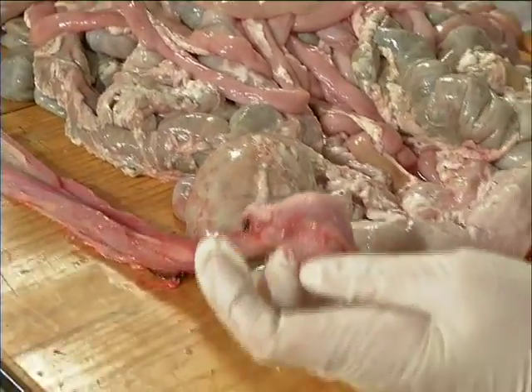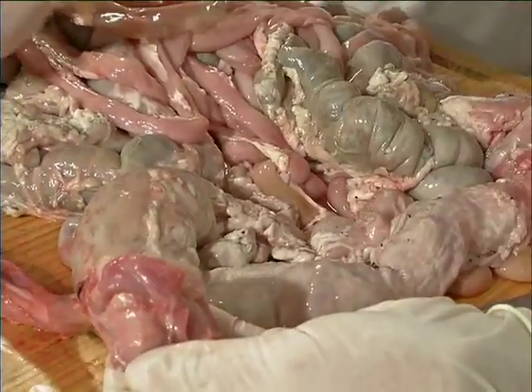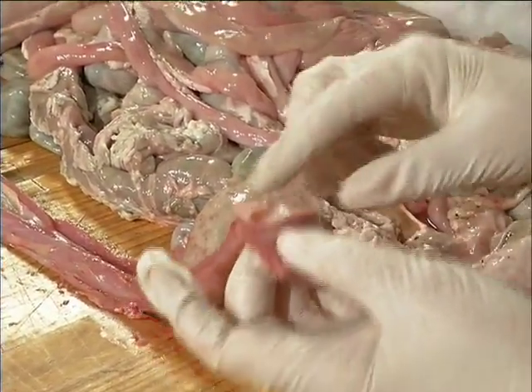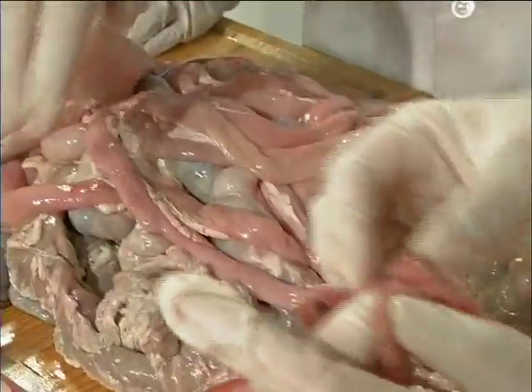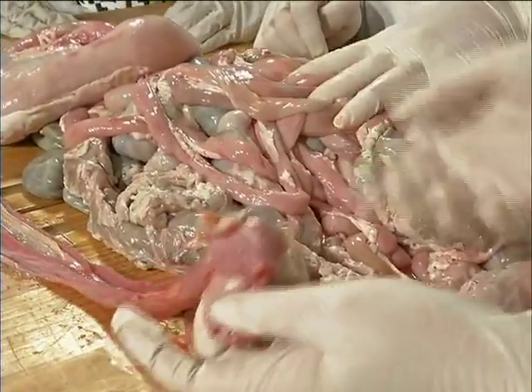She just opened it up. Now you could see them together there, and then I just cut them apart. So this part is where the food goes down. Feel it. It's nice and soft and slimy. And then that was the hard part that you felt, that was the muscle. Cool, huh? Awesome.